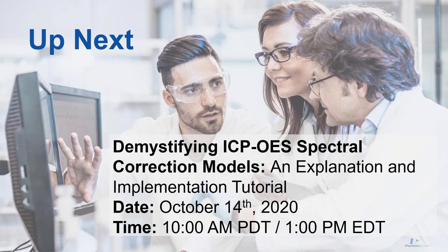Okay, what that was for us is when we were doing the USP work, they specify you have to run the 23 elements that are specified. And then when you calculate the J values, they say the calibrations have to be 0.5 J and 1.5 J, and then you have to read back J concentration as part of the QC. So what I did is I took the single element standards, all of them that were present at the 1.5 J value, because I figured those are going to be the highest. If there are going to be interferences, there'll be interferences up there. And that's why I ran the single elements to see what was going on.